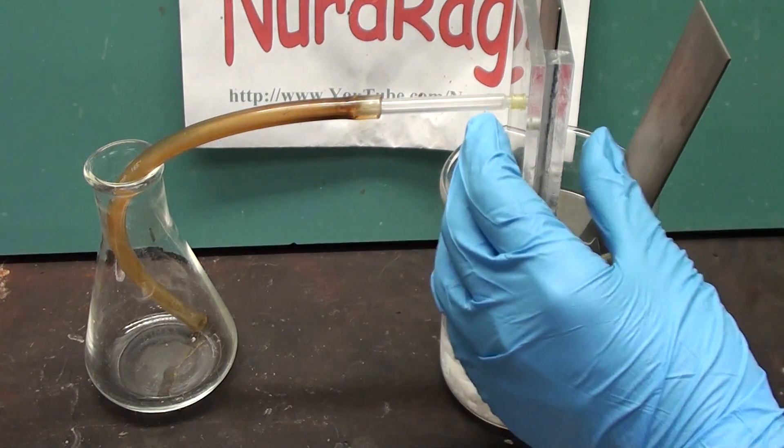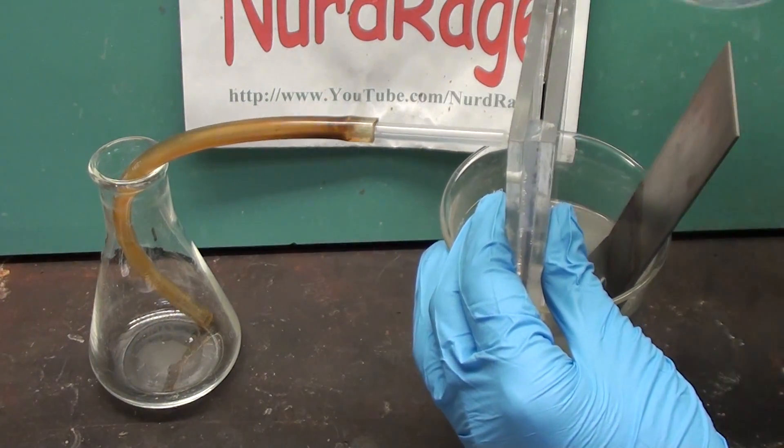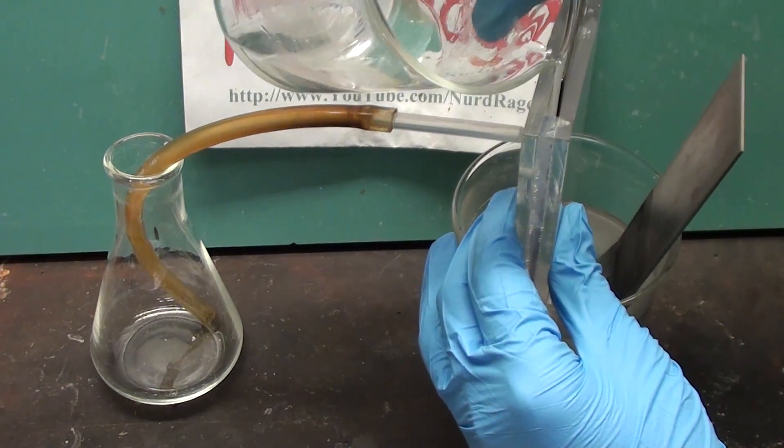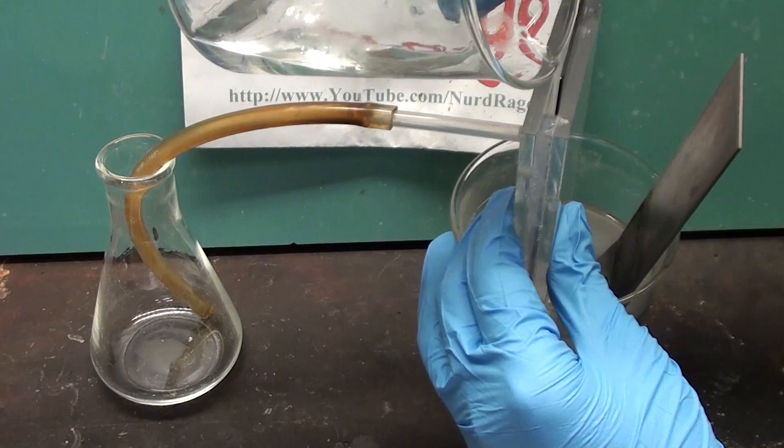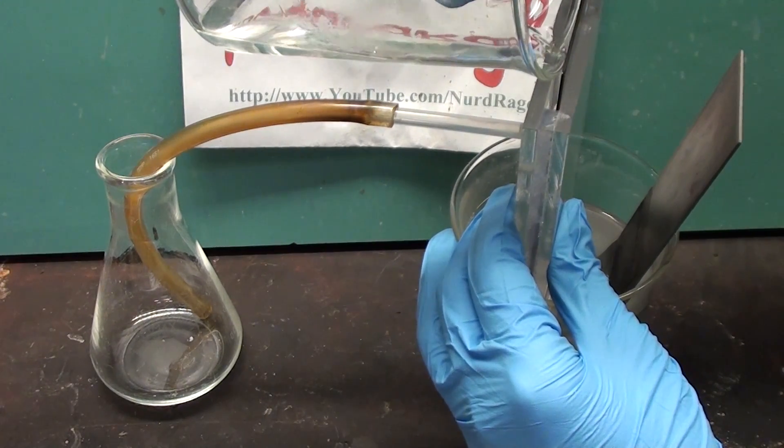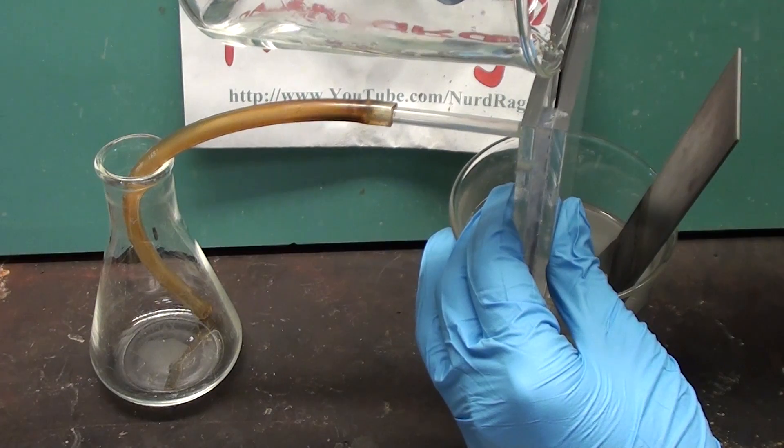The inner compartment needs electrolyte as well so I'm going to pour in some deionized water to fill it. Normally deionized water is non-conductive but a small amount of sodium ions will diffuse in through the membrane to jumpstart our electrolysis.